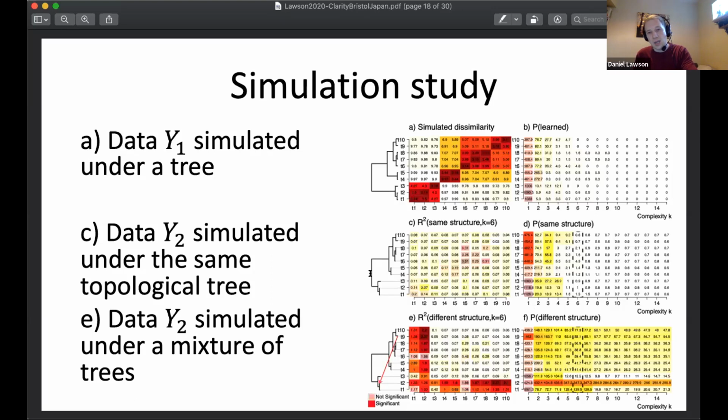So as you can kind of see, the biggest split at complexity 1 here was between these clusters 1 to 3 and everything else, whereas now that's not the largest split anymore, and so it focuses instead on T6 through T10, something like that. But these do not persist. So these changes in relationship do not persist, and therefore when we get to some complexity, here it's 6, then the residuals stop being significant anymore, and we're left instead with saying that this structure is explained.